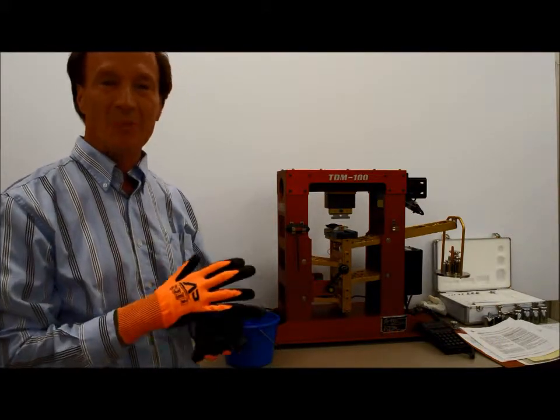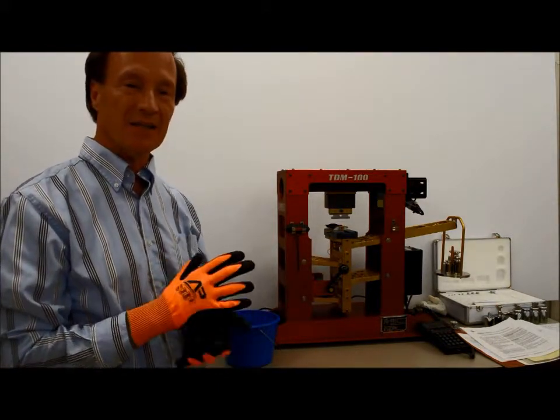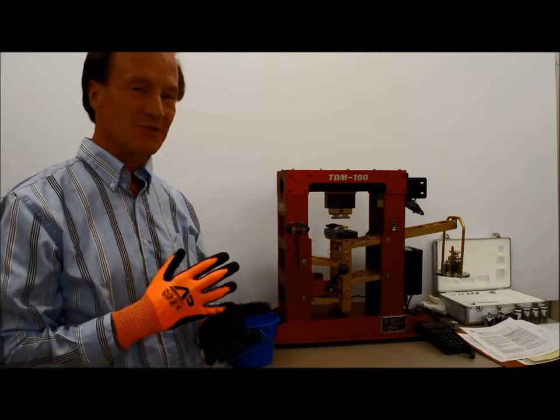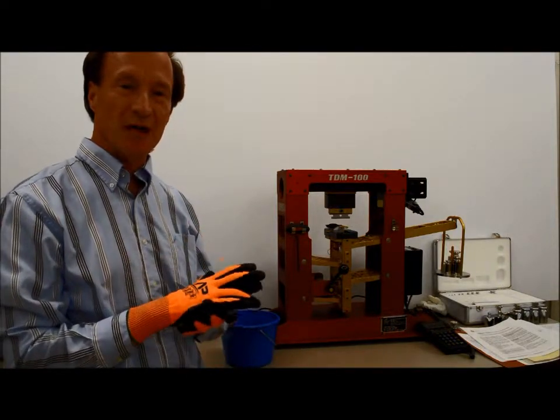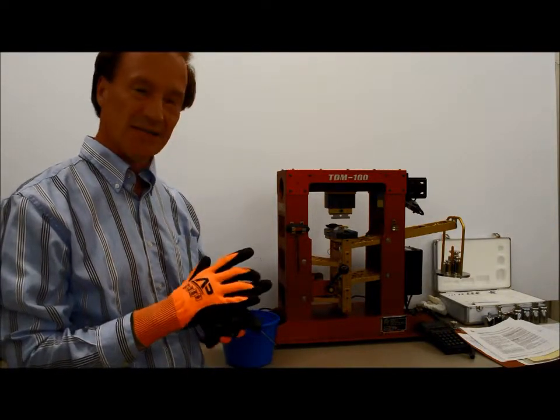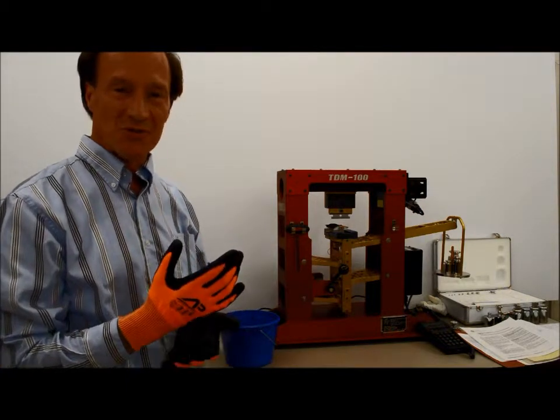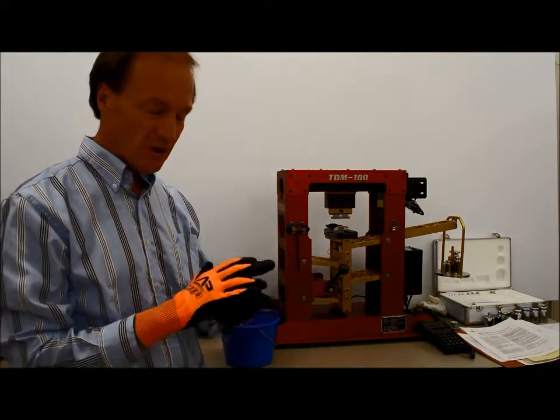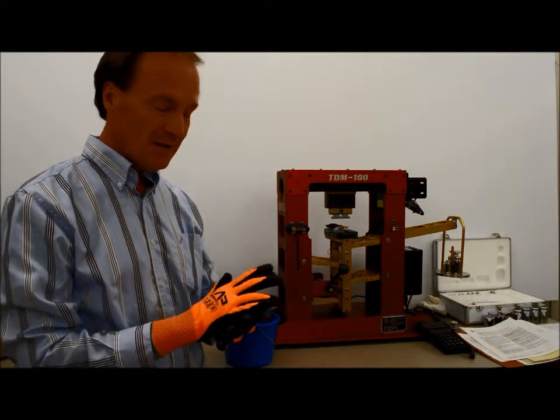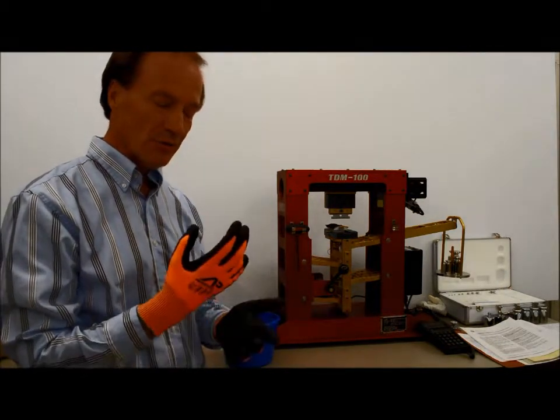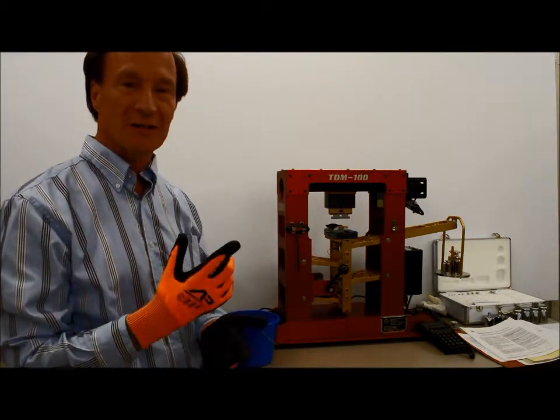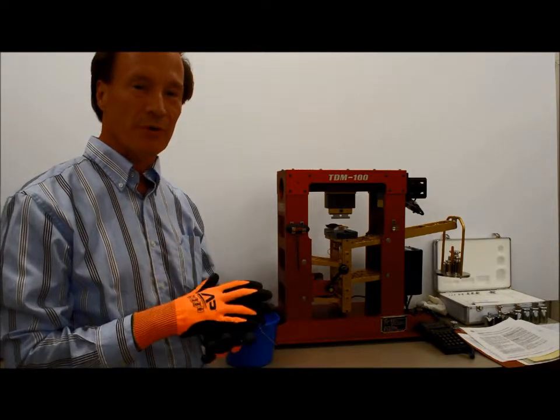For our new product line at Apollo Marketing that are color coded by the ANSI cut level, we've done a lot of cut resistance testing. Today we're going to show you how you do that test, how the test is performed, and what the results tell you. You'll see that all of our product lines are backed by an exquisite amount of data, and these gloves are developed not only for their comfort, but also for their durability, and especially for their cut resistance.